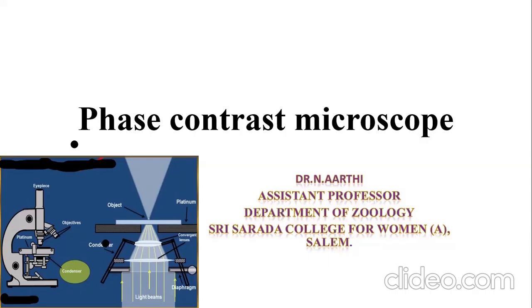In this session, we are going to discuss the phase contrast microscope. Let me introduce myself as Dr. N. Aarthi, Assistant Professor, Department of Zoology, Sri Sarada College for Women. In this session, we are going to discuss the phase contrast microscope.